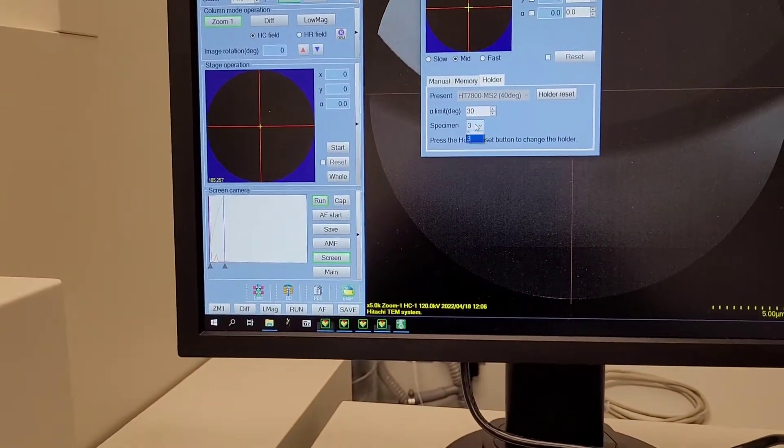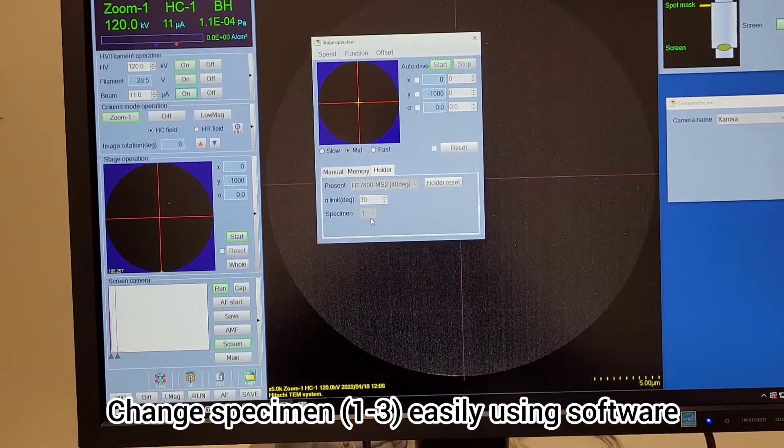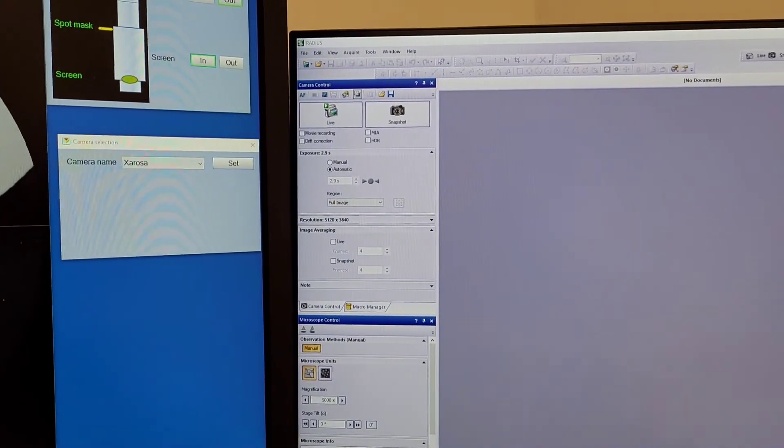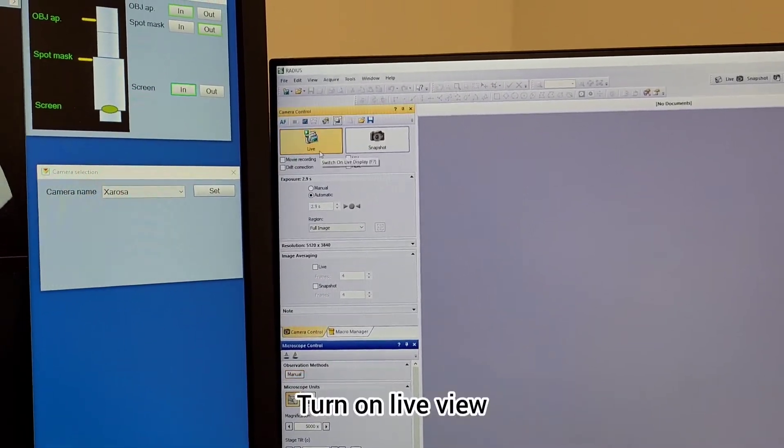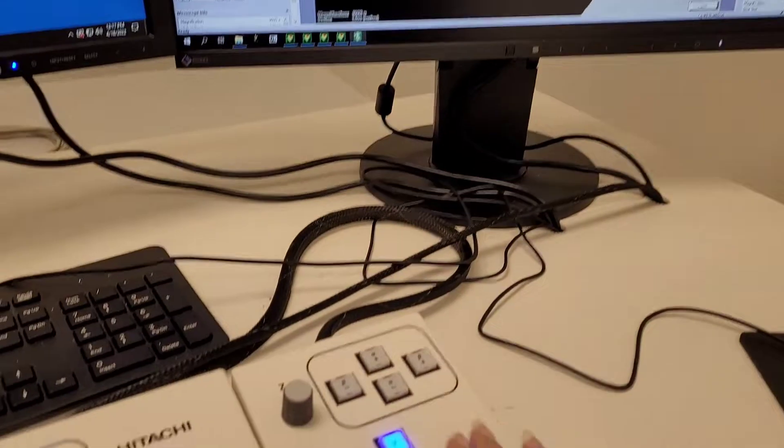But before that, make sure that you're on the right specimen. I will move to specimen one and turn on the live view. You can finally see what is on your grid.